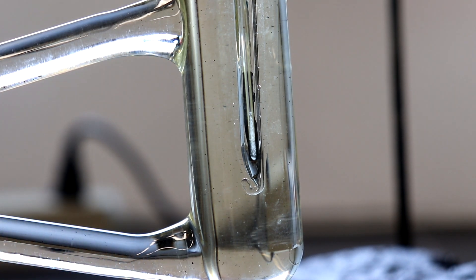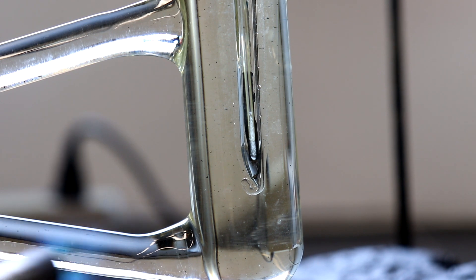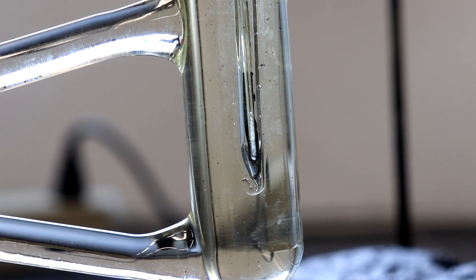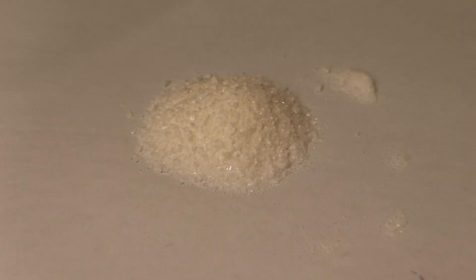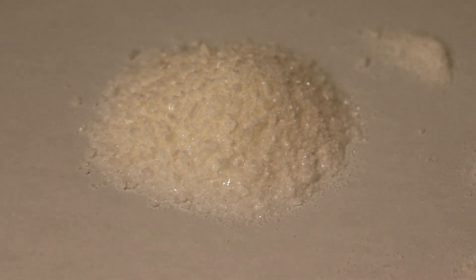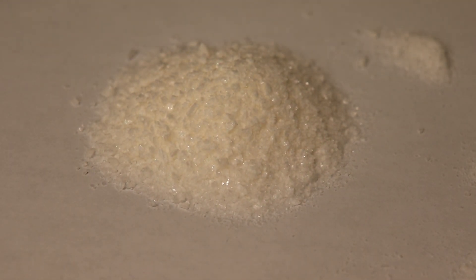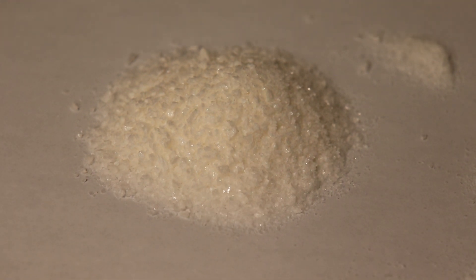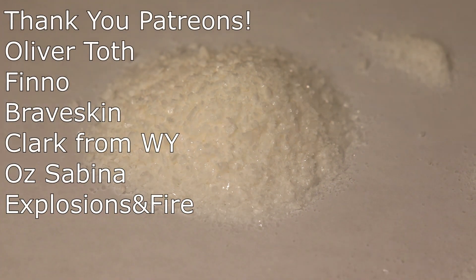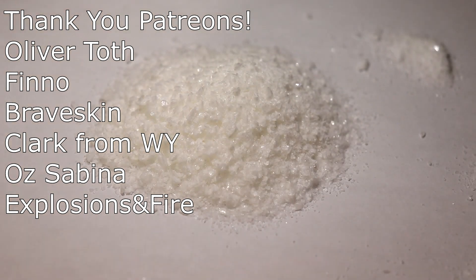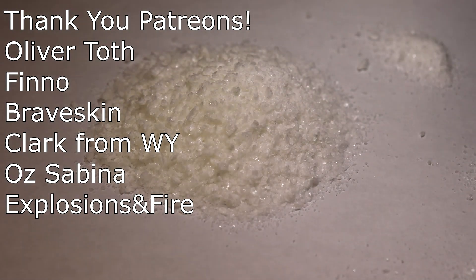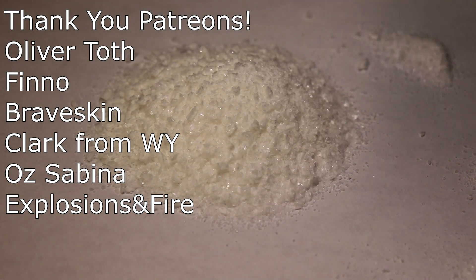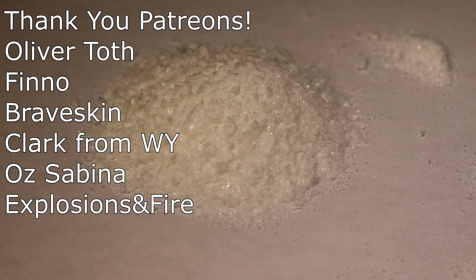The final yield was 12.7 grams of quite pure and white product from the ether extraction and 4.6 grams of lower purity off-white product from the chloroform extraction. The total is 17.3 grams, which is a 72% yield. Compared to the 75% yield in Vogel, this synthesis was quite successful. And if I hadn't run out of ether, then I probably would have had a slightly higher yield with pure product overall.